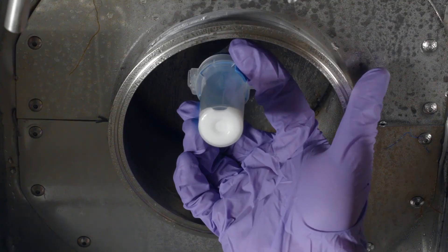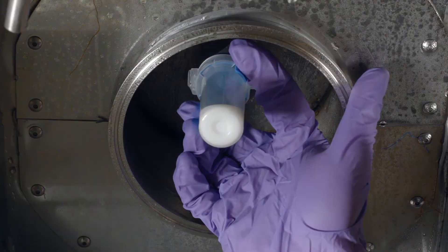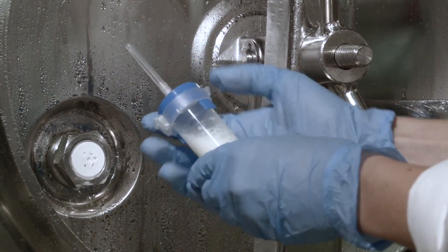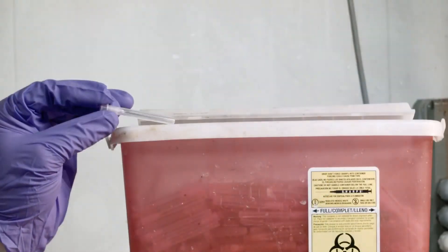Once your sample has been collected, withdraw the needle from the septum. Place the safety cover on the needle, remove the needle, and discard it in a sharps container.